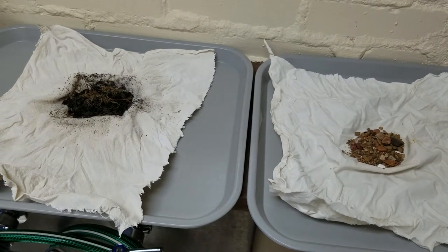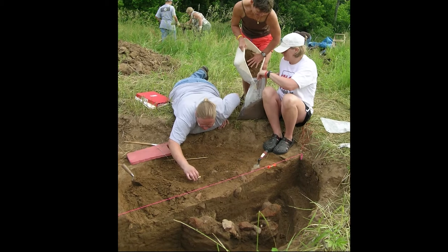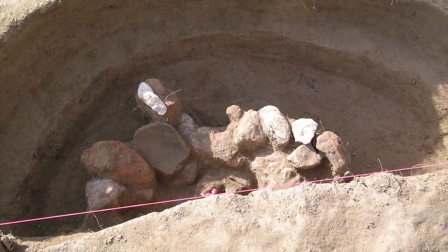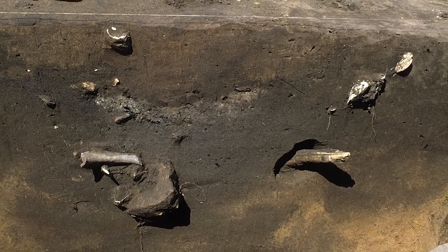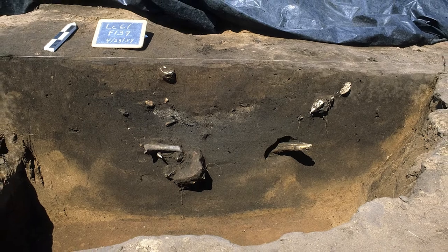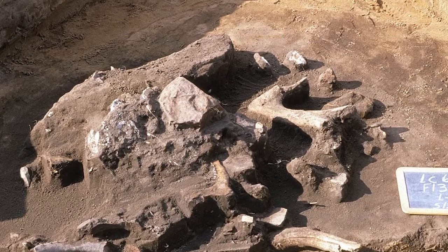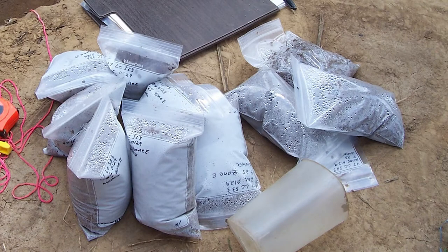Let's look at this process in more detail, starting in the field. Soil, or matrix samples, are usually taken from features — areas such as storage pits, refuse pits, and hearths that often have concentrations of artifacts, bones, or charcoal. A feature might contain layers or zones that reflect a series of different activities. We take samples from features or zones within them to help us understand the different activities represented, often from locations that look especially interesting, such as a zone with lots of charcoal or animal bone. The samples are collected in plastic bags and labeled with their provenience — the exact location they came from — as well as the date and the initials of who took the sample.